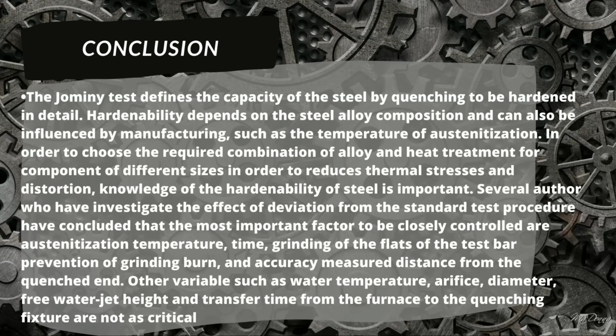Several authors who have investigated the effect of deviation from the standard test procedure have concluded that the most important factors to be closely controlled are austenitization temperature, time, grinding of the flats of the test bar, preventing grinding burn, and accurately measured distance from the quench end.